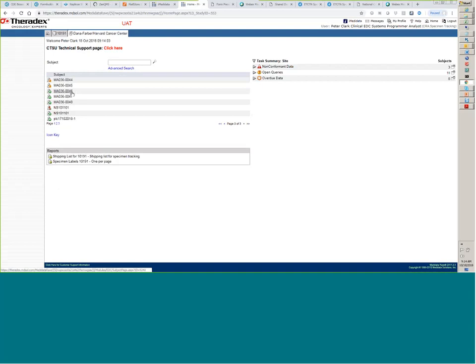These patients, patient 46, 47, and 48, were just entered in open yesterday. We're not going to spend time right now looking at the open environment, but from the slide deck that I showed you first, if you recall, there's the first step of the registration process. And the first step leads to a patient coming into RAVE, and patient 48 we'll consider that to be that first step patient. So this patient, patient 48, is not registered yet. We don't know if they're going to be eligible for the protocol.